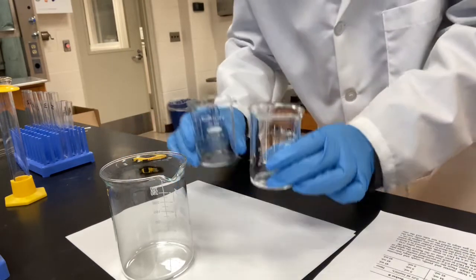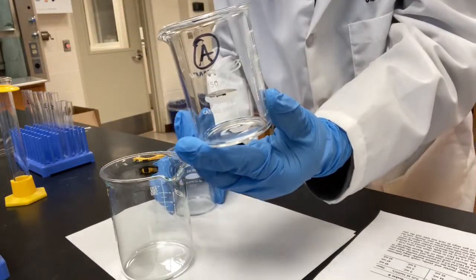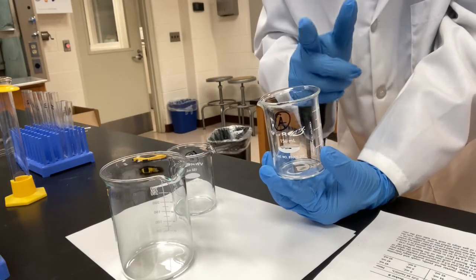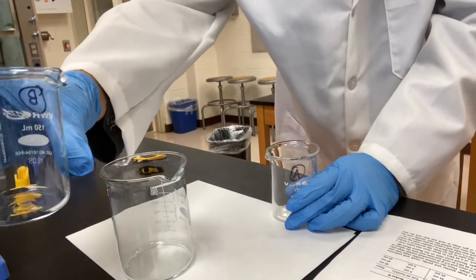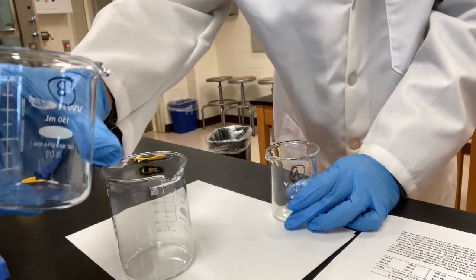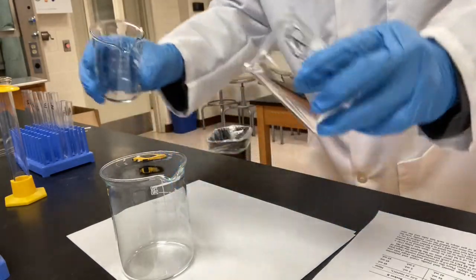This is how we're going to perform this experiment. We are going to have 2 beakers. In beaker A, we are going to make a solution that contains potassium iodate and starch. In beaker B, we're going to make a solution that contains sodium bisulfite. Then we're going to mix them together.